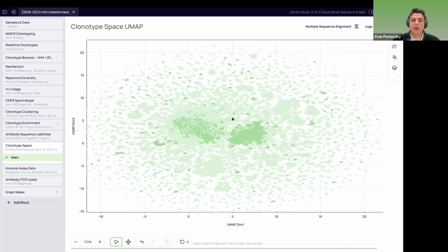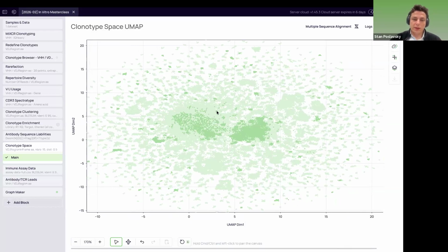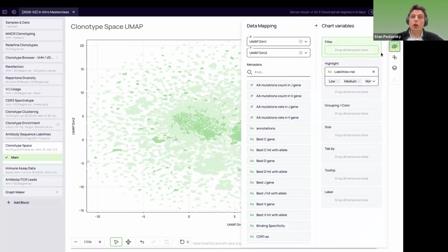In the case of this specific experiment, that's the reason, because the library was generated not in a very efficient way. And that's typically what you want to avoid. But that's what we have here, and that's a reality. So the highlighted antibodies are those that do not have critical liabilities that we can't fix downstream.